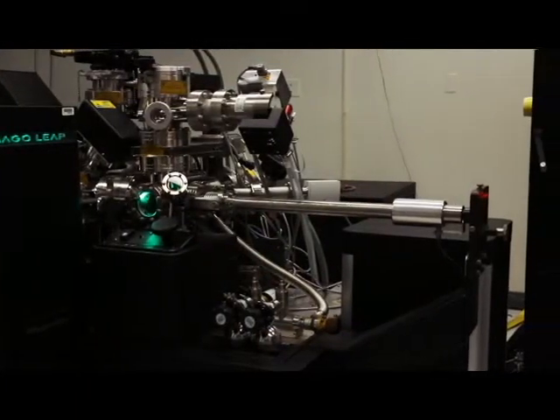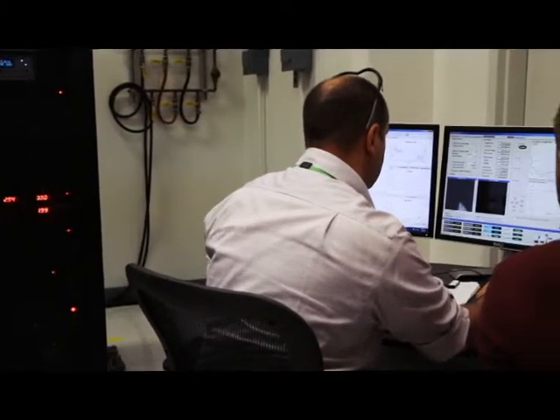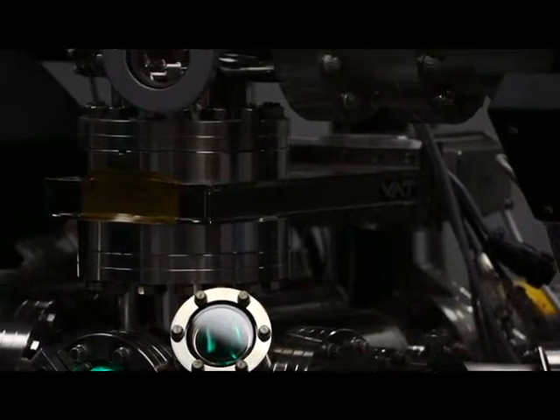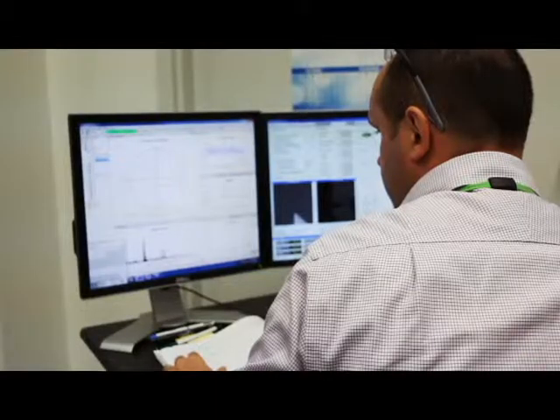problem. The issue with the atom probe is that we look at very, very small volumes of material, typically 100 nanometers by 100 nanometers, so very small volumes. So we need to do a lot of experiments to get an overall bigger picture of what's happening on that kind of micro scale, and then we can feed that into other people, so modelers for example, or TEM or SEM, and then get the bigger picture.